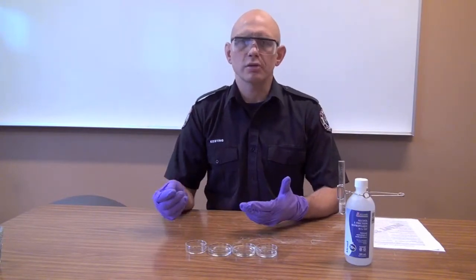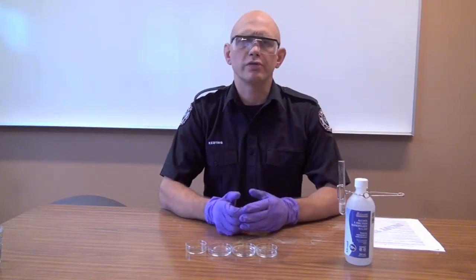If we mix this unknown liquid with water and it starts hissing and it starts bubbling, then we know it's water reactive. This might really change the course of what we're going to do at this call.